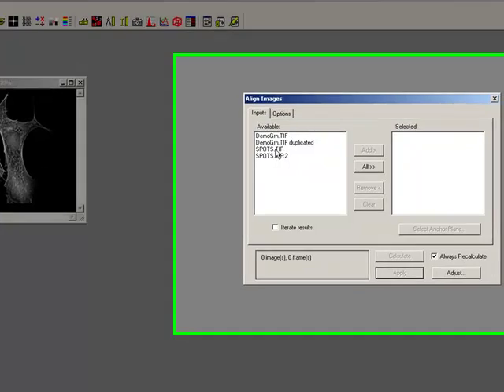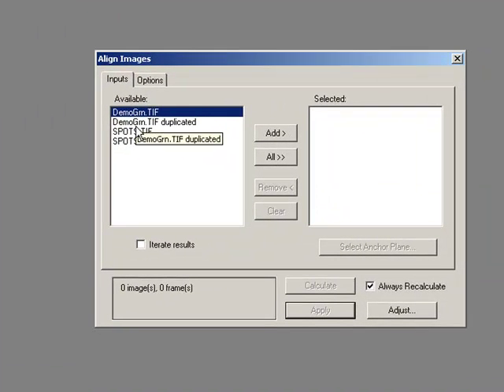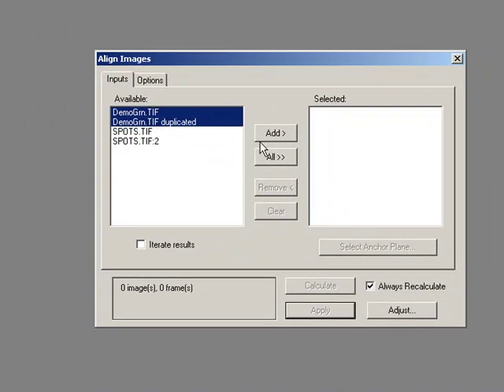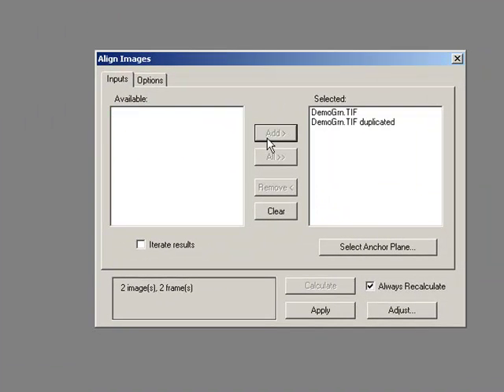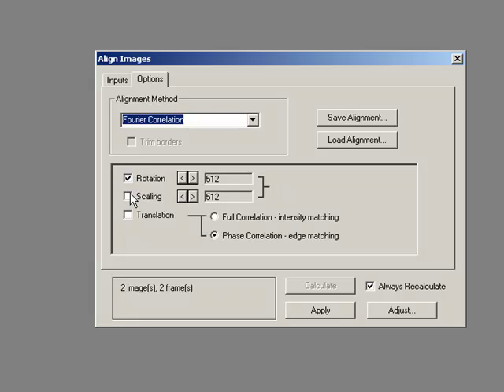So this time I'm going to say let's look at Demi Green and Demi Green Duplicated and I'm going to correct for scaling this time.